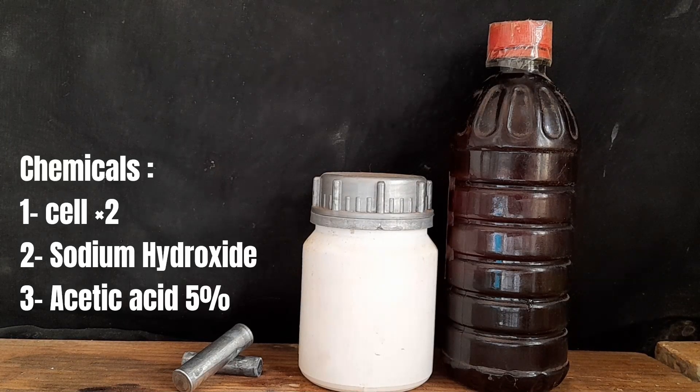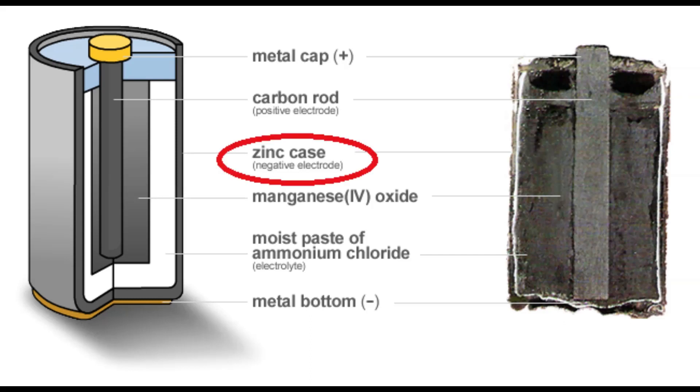Chemicals: two cells, sodium hydroxide, and acetic acid or vinegar 5%. As a source of zinc we will use the cell case.